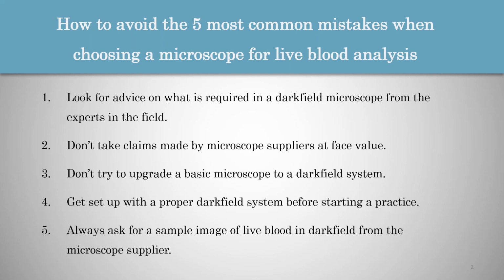And can a phase contrast microscope be upgraded? It really depends on the specifications. One would have to look at the specifications of the microscope, specifically the light source. That would be quite important. The phase contrast systems, similar to dark field, also require a fairly strong light source, but not as strong or as bright as dark field. So some of the phase contrast systems would, for example, have a 30-watt halogen light bulb, whereas a dark field microscope would usually need to have a 50-watt halogen light bulb. So one would need to have a look at the specifications to see.